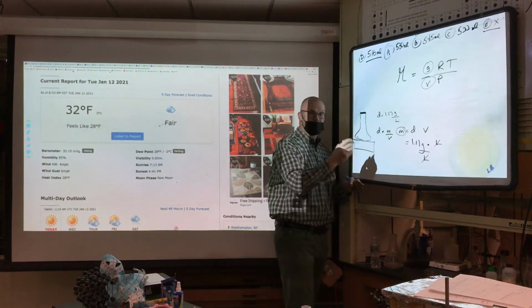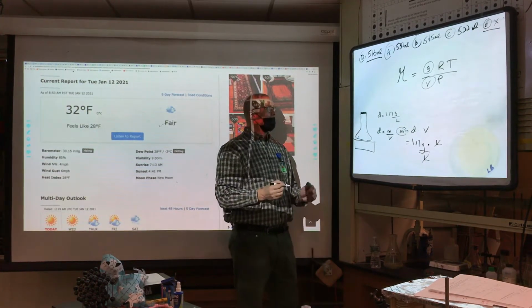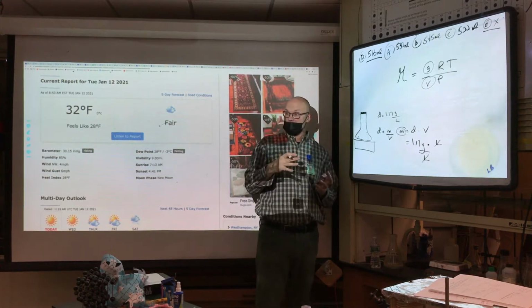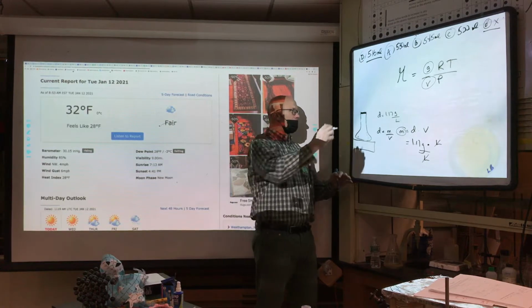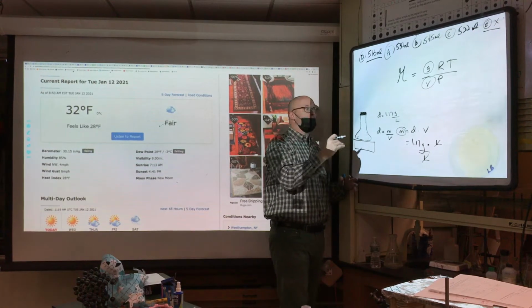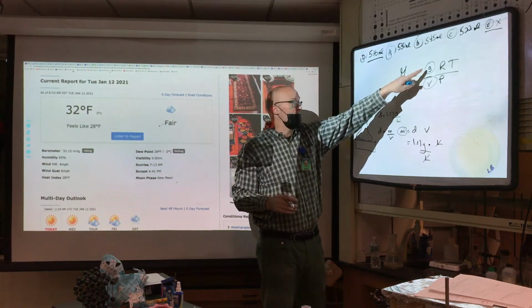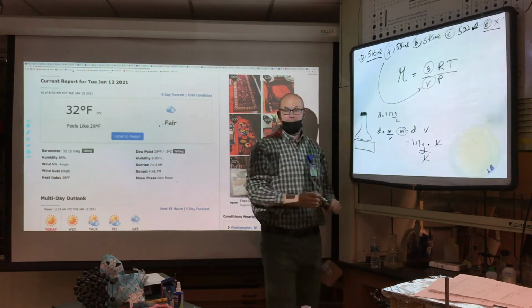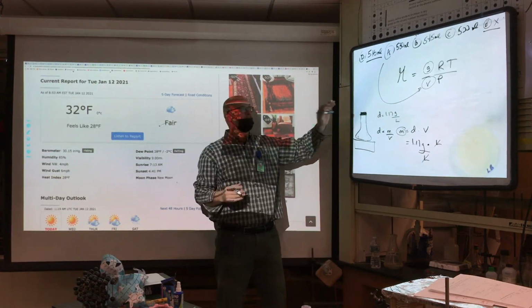So once we know the mass of just the container without the air, by subtracting the mass that we get by using the density of air, now we're going to flush this with the two gases in the container I'm going to show you. And then we're going to stopper them, put them on the scale, subtract out the container, and we're going to get the grams of the two gases. The volume of our two gases is whatever containers we pick, that students have already filled up with water.